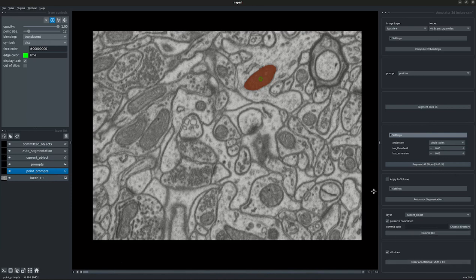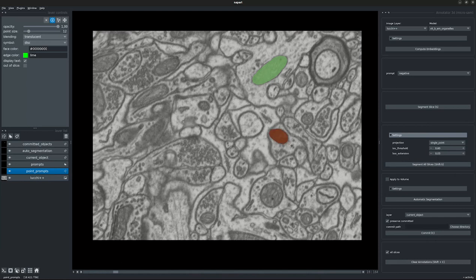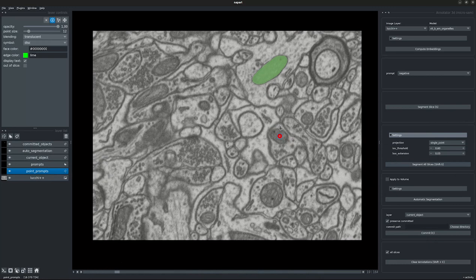Now let's commit this object. Let's try segmenting another object, so we put a positive point prompt and segment the current slice. Let's say we desire to stop our segmentation at a particular slice — we put a negative point prompt there and then segment all the frames. We see that the segmentation did take place and stopped a slice before we put our negative point prompt. Let's go ahead and commit our segmentation.